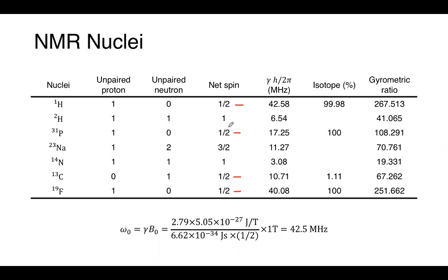It's still basically the same thing, but the kinetics have changed. And it's also changed the net spin to be 1, which means that it's going to be largely invisible to our proton NMR, which means that we can cut it out of the spectrum if we want by replacing the hydrogen on our molecule with deuterium. I made that sound a lot easier than it is. It can be quite easy in certain cases, and it can be very difficult in others.